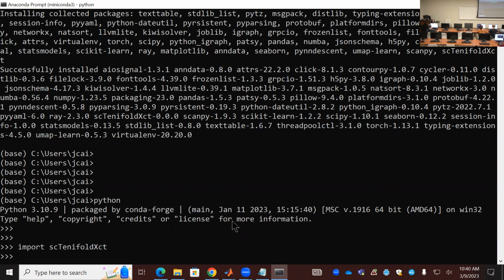Did you install this? So you haven't finished the installation. Oh, okay. Yeah, it takes some time to run. So we have to get out from this environment and run this again. This will take time. Once this is completely finished, we should be good.